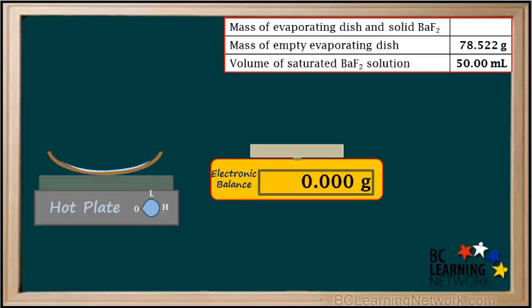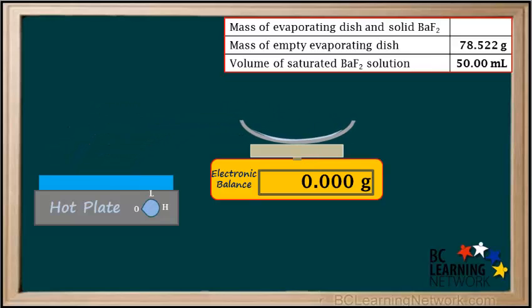We turn the hot plate off and let the dish cool down. After it's cooled, we place the evaporating dish with the solid residue back on the electronic balance. The reading is 78.553 grams — this is the total mass of the evaporating dish and the solid BaF₂ that was originally dissolved in the 50 milliliter sample of the saturated solution. We record that in the data table.